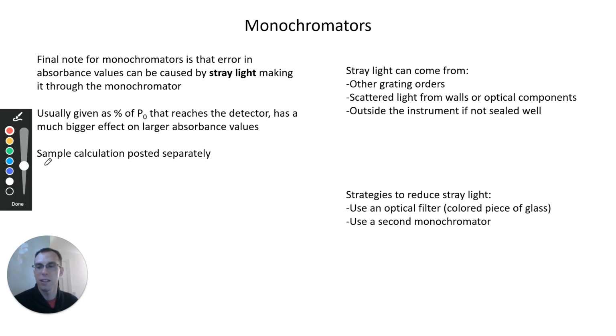I will post a separate sample calculation involving stray light and how we can actually calculate how much the error will be, given a specific amount of stray light. And again, you'll have homework questions related to this, or I think one homework question related to this.